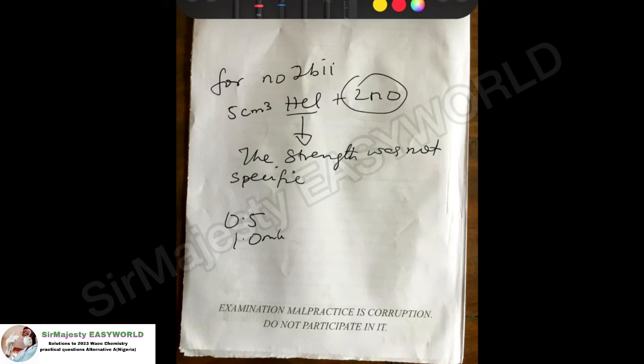And when the whole zinc oxide dissolves, it leaves behind excess HCl, which will consume any base like sodium hydroxide to form salt and water first. Only after the whole acid has been consumed will the sodium hydroxide start reacting with the zinc to form any precipitate at all.